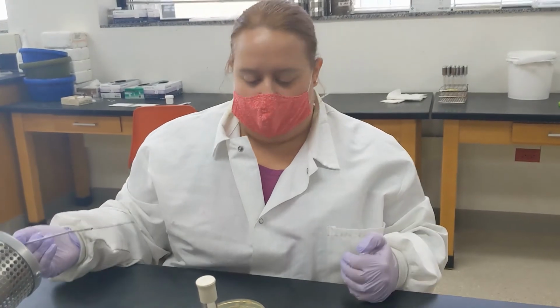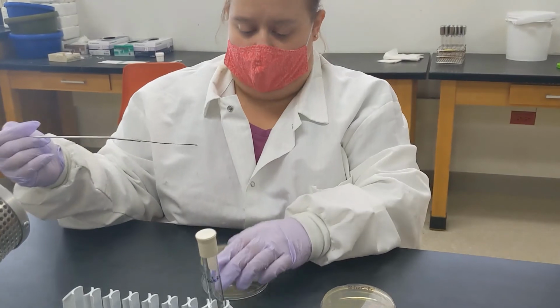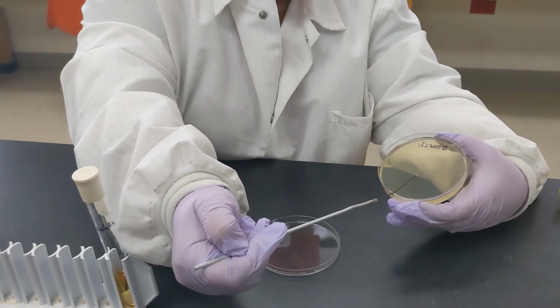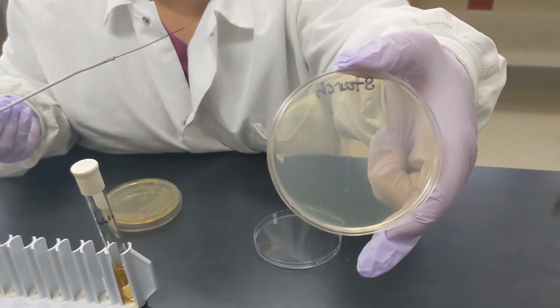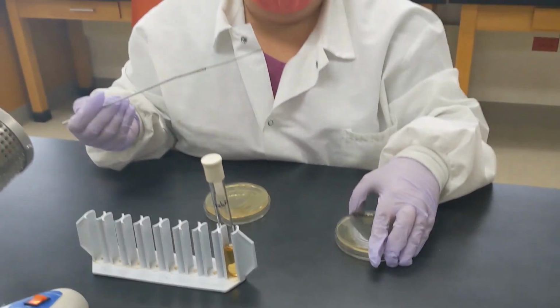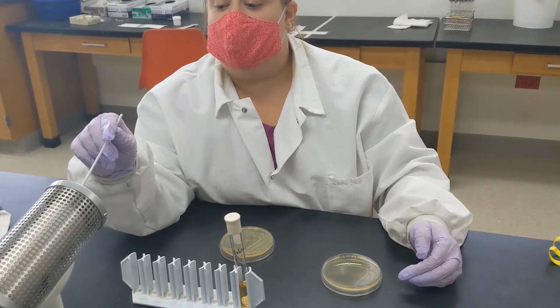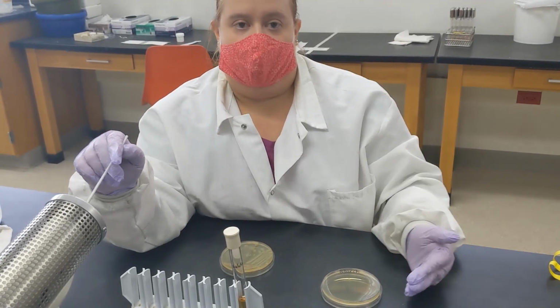So again, you sterilize your loop. You're going to pick up one isolated colony from your plate, and then to do our starch plate, we are going to make one streak straight down the center of your plate, about an inch or so long. So your plate will be streaked like this. We want to keep all of our culture concentrated to that one streak so we can look for any clearing in the starch surrounding the streak. If you were to streak for isolation, it would be very hard to see if your organism is producing amylase.